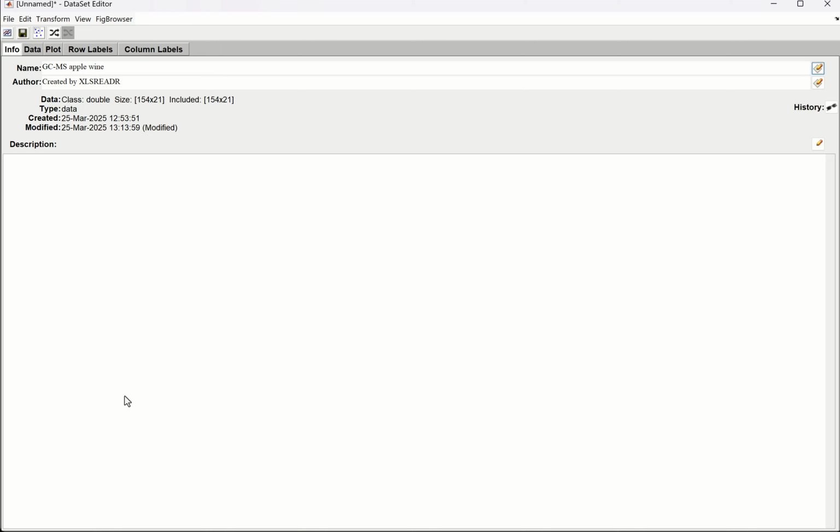Which makes sense, but the thing is, in PARADISE we don't actually have a limit of detection. We quantify in all samples. Now you may afterwards decide to define a limit of detection, but all analytes are quantified in all samples. That's simply built into the way that these things are analyzed. So there is no limit of detection. I know some analytical chemists will disagree now. So yes, limit of detection exists, but that's for when you have a specific purpose in mind. The actual method, the PARAFAC2 model that is used to integrate the data, will quantify all the chemicals in all the samples. So let's take a look at the original data in PARADISE.